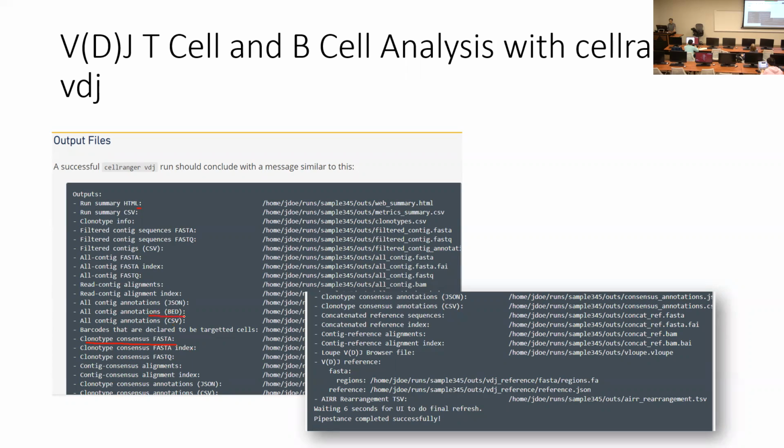And that's mapping, and they tell you where this raw sequence was mapped to. The most important file, I believe, is the consensus and annotation. A lot of them are intermediate files from the pipeline, from one step to another, mapping and assigning receptor genes and subtypes, and at the end, you will have this.